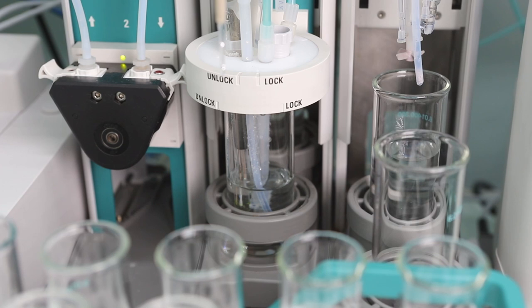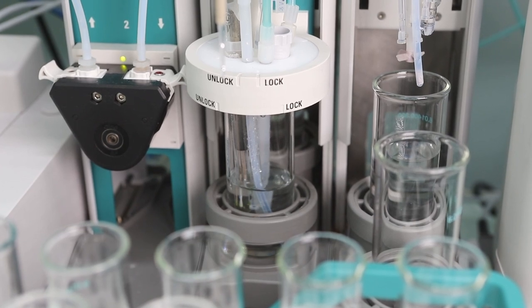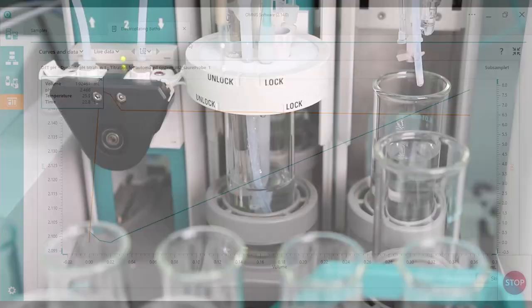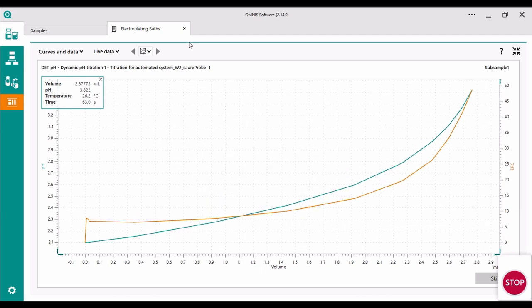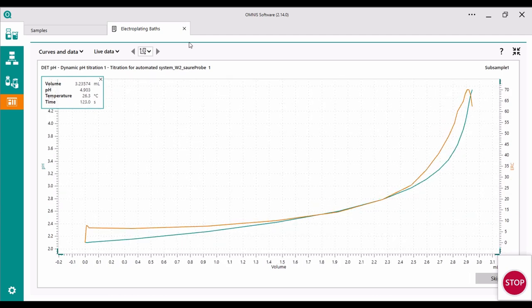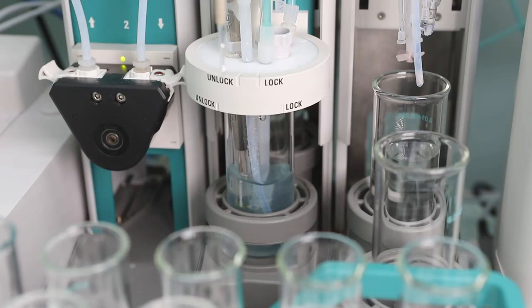After the sample was pipetted the beaker is filled with water and the titration starts. Here we perform a sulfuric acid analysis with a digital unitrode and a 0.1 molar sodium hydroxide solution as the titrant.